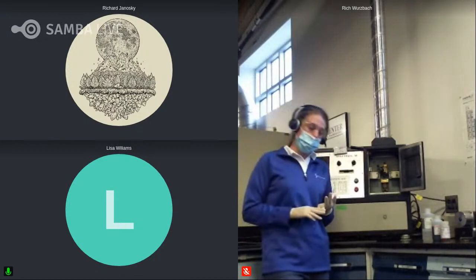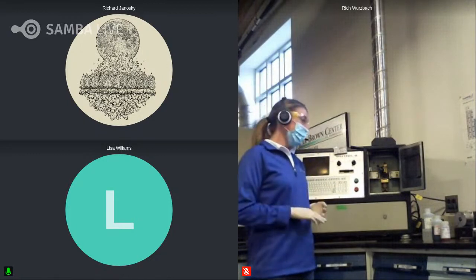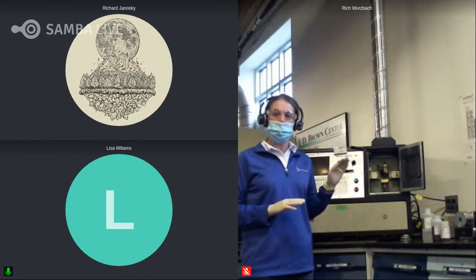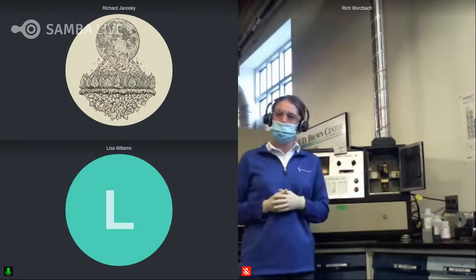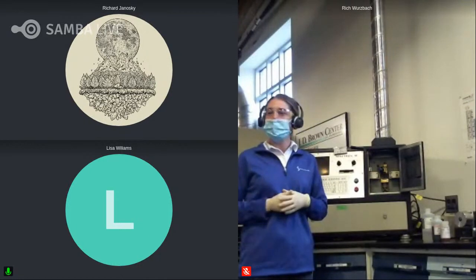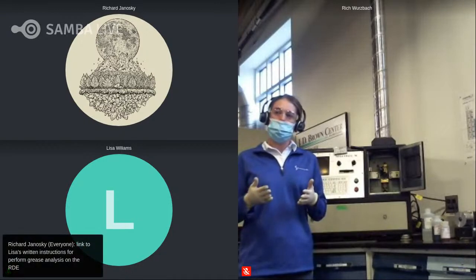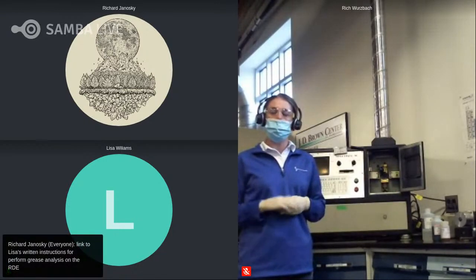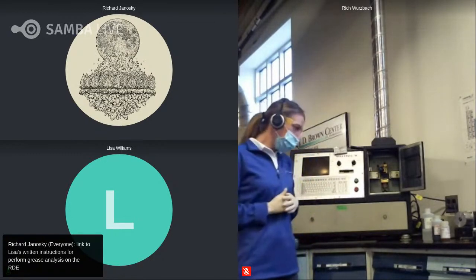Whether or not we're applying that dilution factor, we need to decide and understand that. And then it's a matter of making sure that we have standardized our equipment and checked our calibration, and gone through that PM process to make sure that everything's gapped and working correctly. I'm going to assume that we've done that already, because we have in this case. Assuming we've gone through that whole process of making sure that our instrument is calibrated and standardized, we're ready to go.